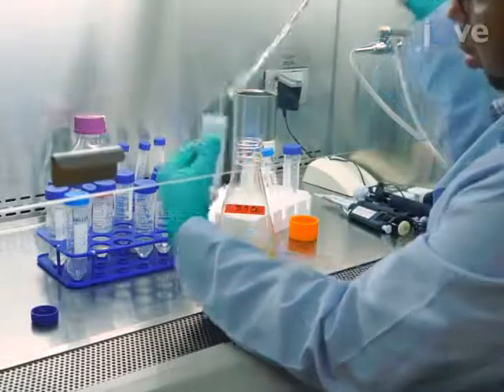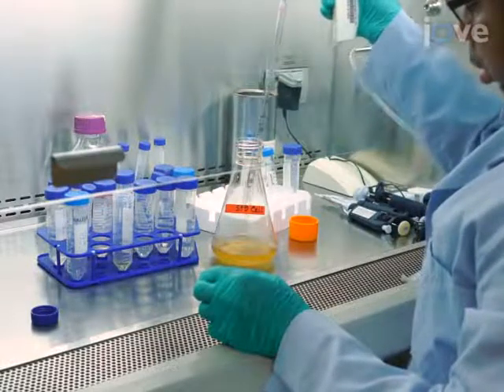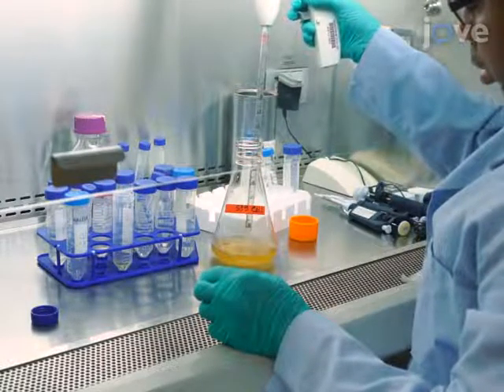Sequentially amplify the baculovirus until the desired volume is obtained by increasing the volume of cell culture in each subsequent infection 10 to 50-fold.